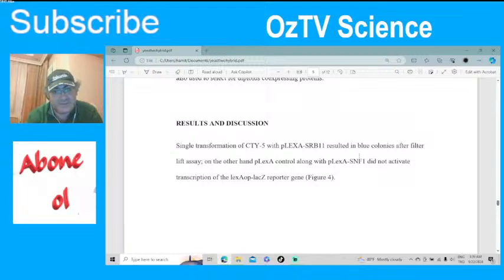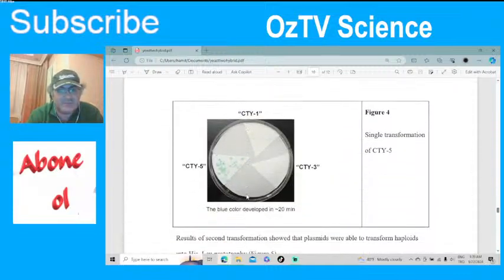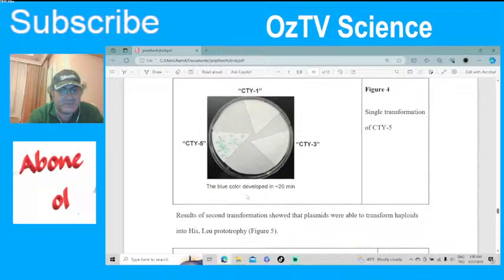And with SNF1, SNF1 didn't turn the reporter gene on, even though it was connected to the binding protein. So these are negative ones, and then what was positive? CTY5. So this is the color you get. It's like a bluish color.